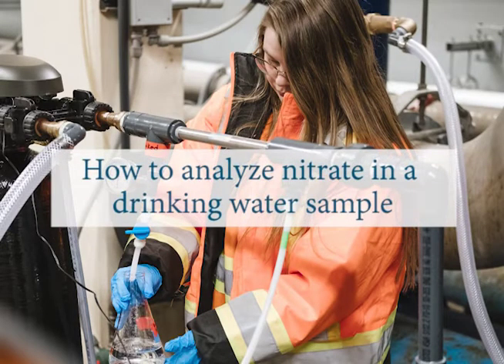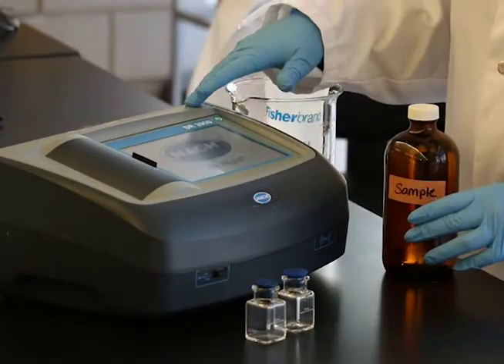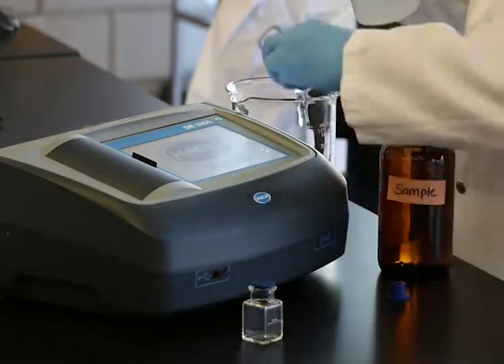This video will demonstrate how to properly analyze nitrate in a drinking water sample using the cadmium reduction method. This is a basic procedure overview.